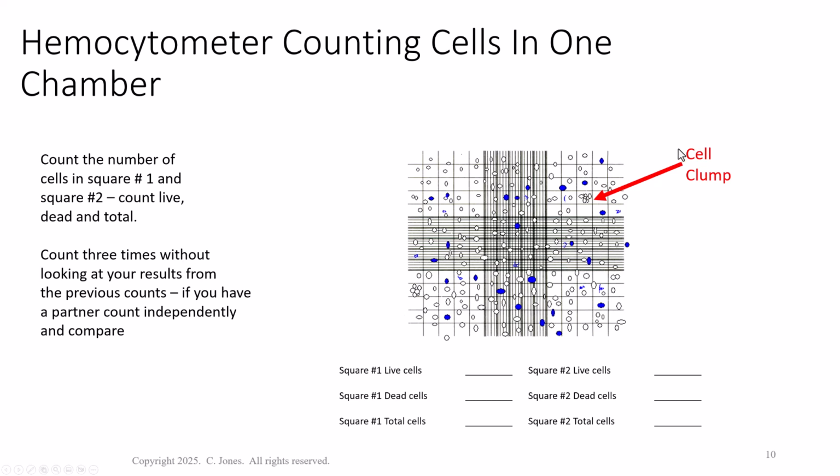So when you have clumps of cells and you're doing counting, there should be a statement in the SOP, in your cell counting procedure, about how to deal with clumps, right? And generally, there are 3 ways that labs or company labs deal with cell clumps. One is to count it as a single cell. So you look at this clump of cells, you know there's lots of cells in there, but you just count that clump as if it were one cell. Okay, and again, the idea here is consistency.